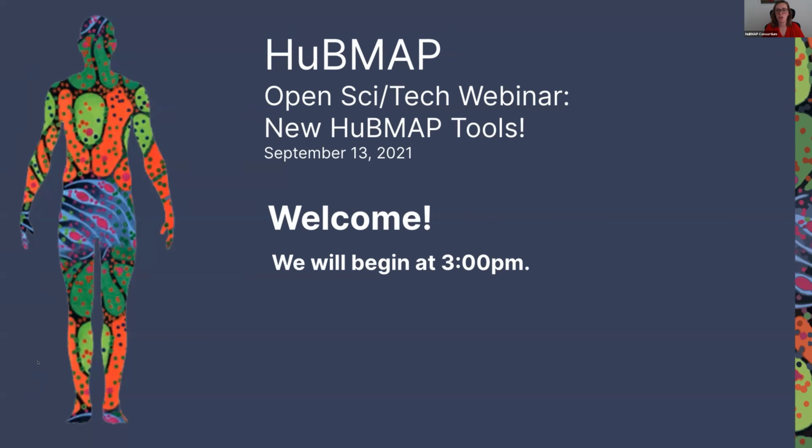We are going to talk about our new HuBMAP tools. If you're on our email list, or if you've heard about this at all, we have a bunch of new tools on the HuBMAP data portal, as well as some new organs, assays, and lots of new data available in the last couple of months. So we're very excited to have two presentations today about two of our new tools.